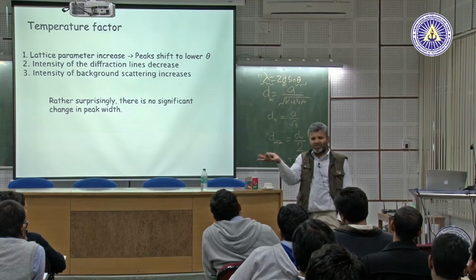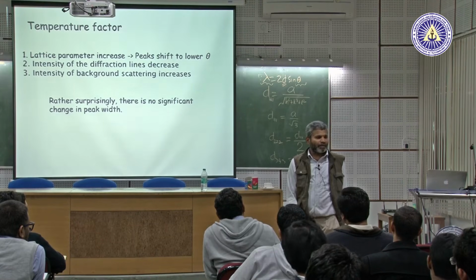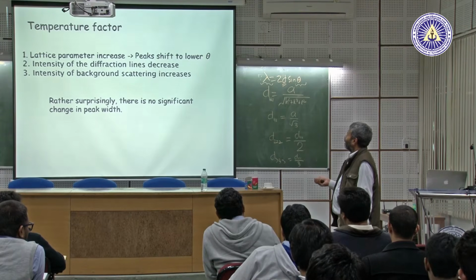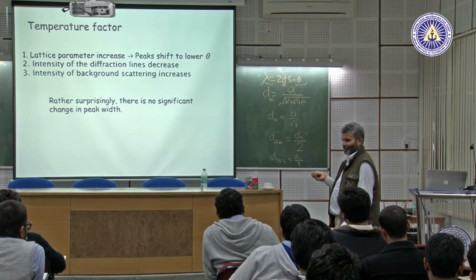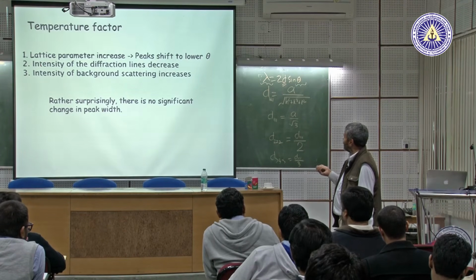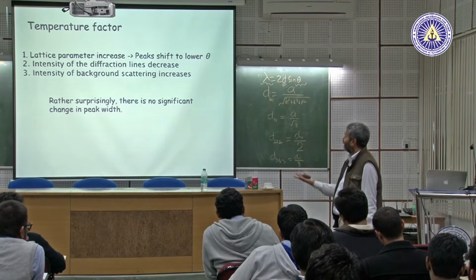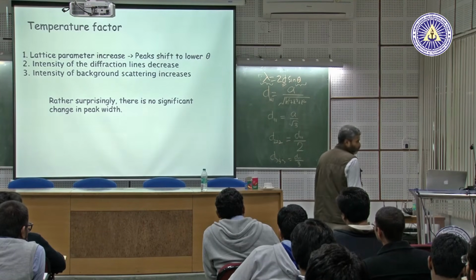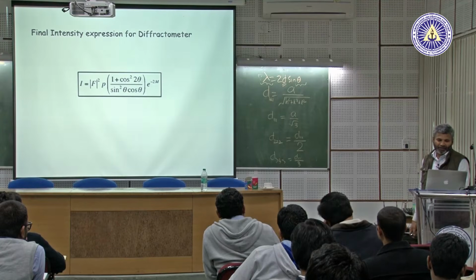One thinking was also that so much random vibration is there that, even if a peak is there, it will broaden so much that it will merge with the background. None of those things happened. So, effect of temperature is there, but it does not kill the diffraction pattern. It only modifies the diffraction pattern intensity and the background intensity. It decreases the peak intensity, increases the background intensity. So, taking into account the effect of temperature on the peak is what is called the temperature factor.